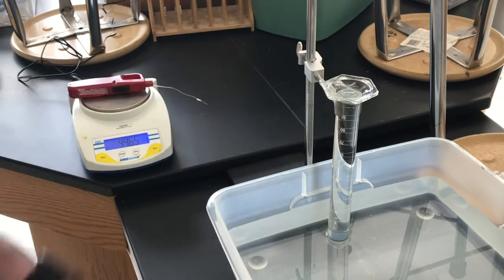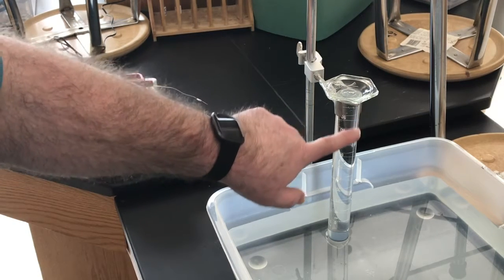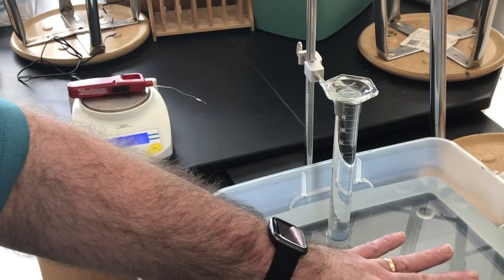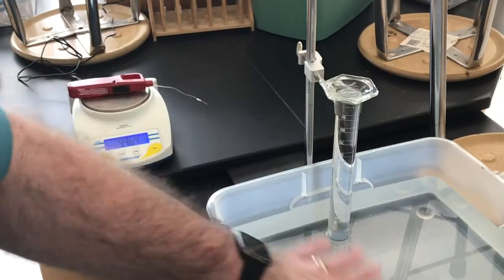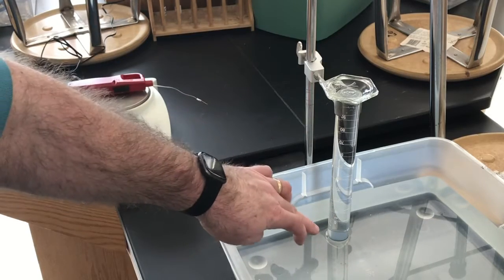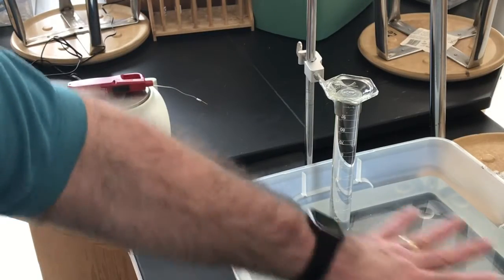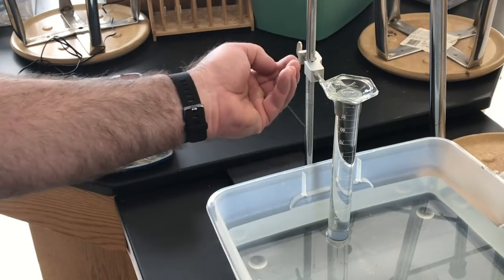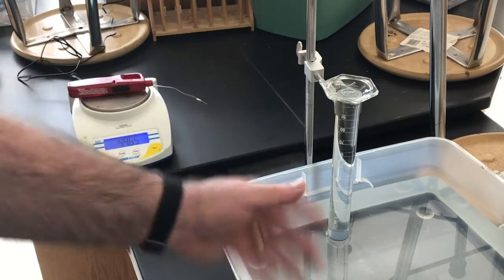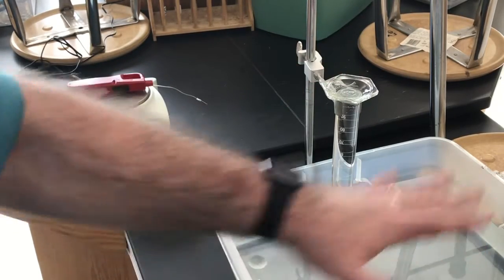The way this works is basically it's going to equalize the pressure. In other words, the pressure of the gas inside the graduated cylinder is going to be equal to the atmospheric pressure that's pressing down on the water, that's pushing the water up inside the tube. That's why the water stays in the tube. It doesn't flow out. As long as this end of the graduated cylinder is underneath the water, air pressure pushing on the pool of water here will keep it pushed up inside there. But as I start bubbling gas inside there, it will push out some water, and the pressure of the gas inside will be equal to the pressure of the gas outside, the atmospheric pressure.